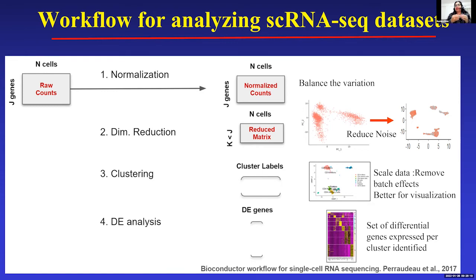That will not only reduce the noise for me, it will also help me better visualize the data, seeing that the cells are trying to bin together based on the variable genes they have in similar, as compared to the other cells in the sample. And these bins basically lead to clusters.